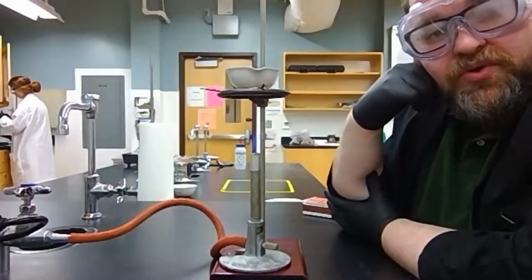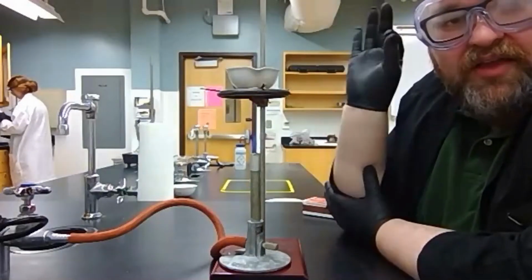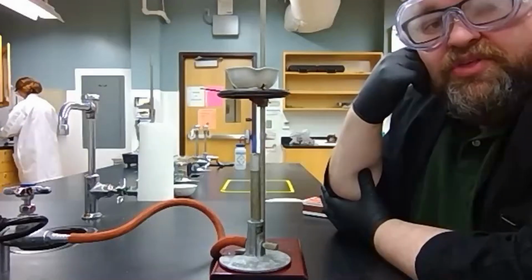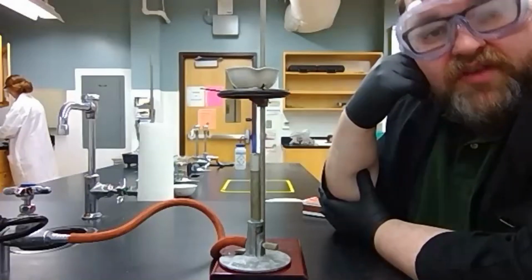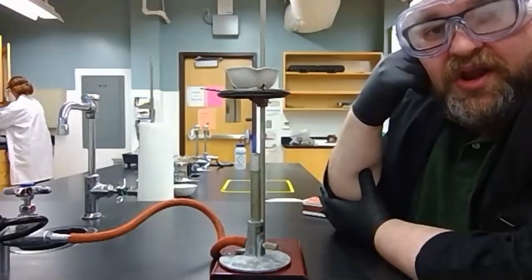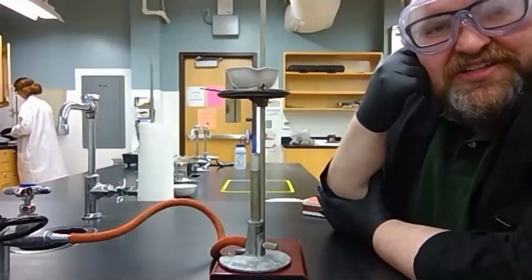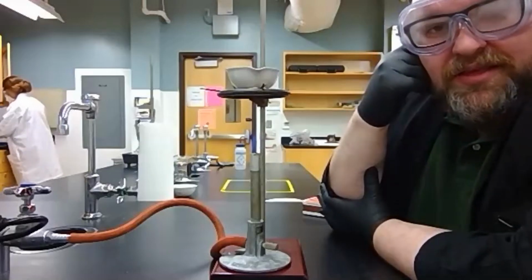We're going to allow it to cool completely to room temperature. Once there is absolutely no water left in there, we're going to cool it all the way back down to room temperature, and then we're going to obtain the mass of the evaporating dish with the salt in it. The mass of the evaporating dish with the salt minus the mass of the evaporating dish gives you the mass of the salt. The mass of the salt divided by the mass of the original mixture times 100 equals the percent of salt in your original mixture. The percentage of sand plus the percentage of salt is called your percent recovery. That tells you how efficient you were at doing this exercise.